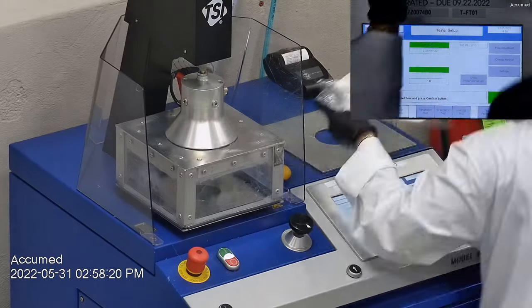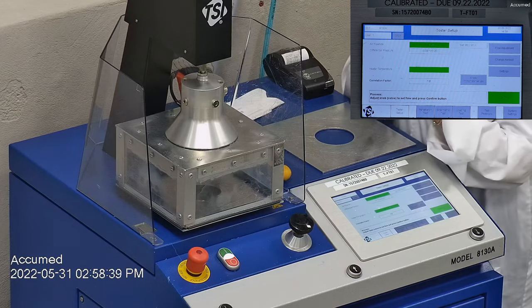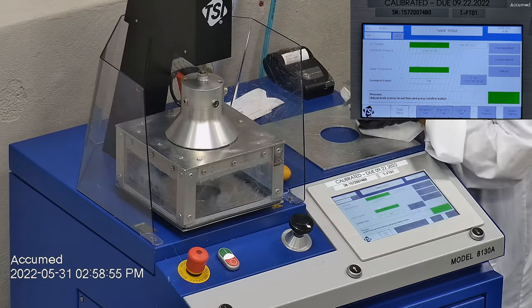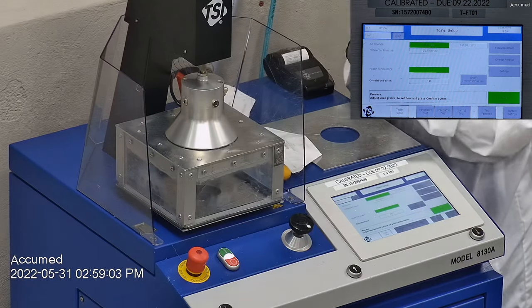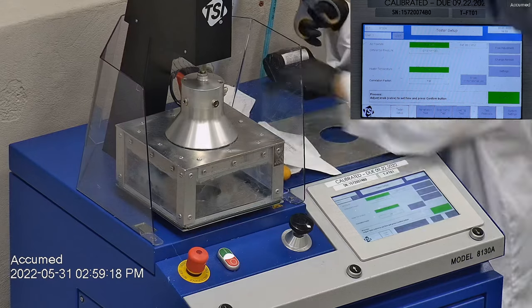This is our TSI machine model 8130A, which is also the same filtration testing machine that NIOSH uses to approve N95 respirators. Our procedure is inspired by NIOSH. We first run a tester setup and start removing the headband from the respirator before placing it onto the testing plate to ensure a proper seal.